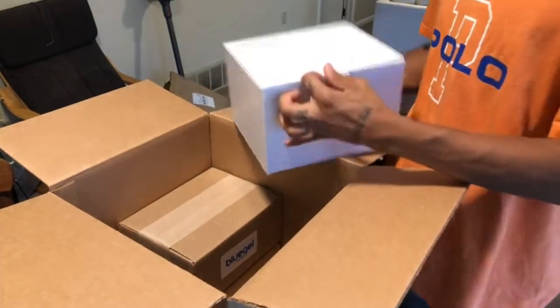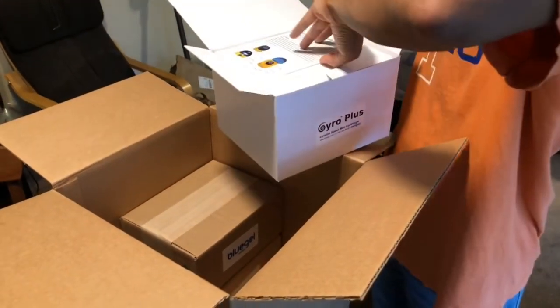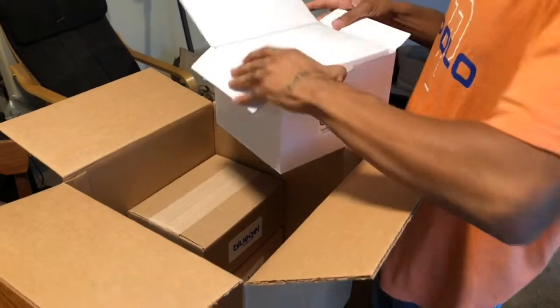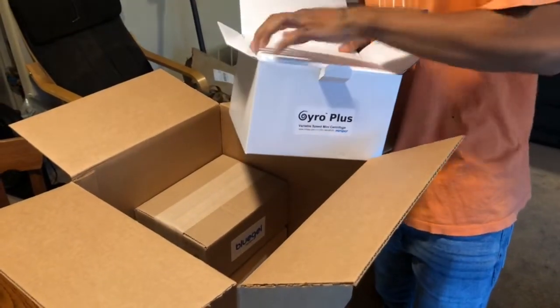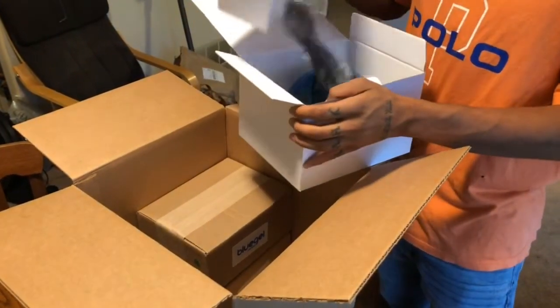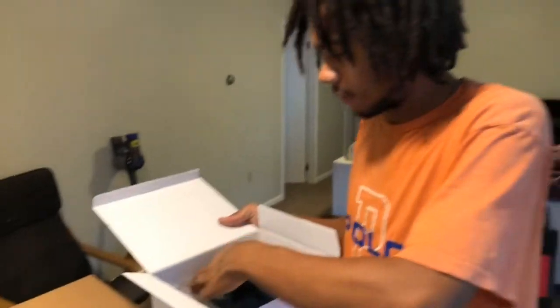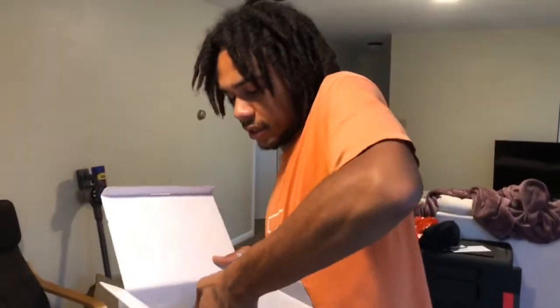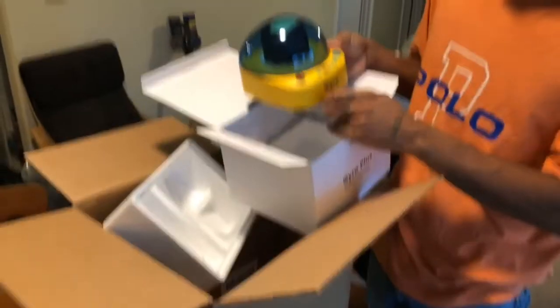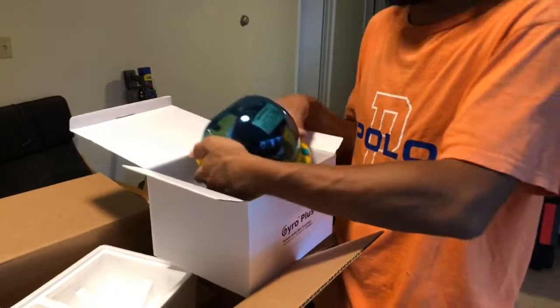And then we have our Gyro Plus micro centrifuge. I have another larger centrifuge down in the basement, but this one's portable. The one in the basement is very, very heavy — I wouldn't want to take it places. But this one's going to be nice for traveling, because you might want to be extracting DNA in the middle of the woods when you're out foraging and finding all sorts of things.